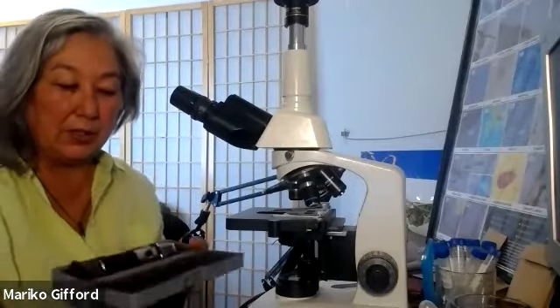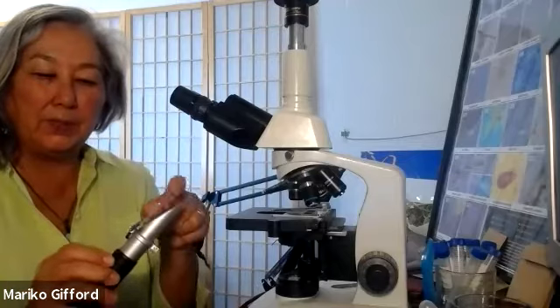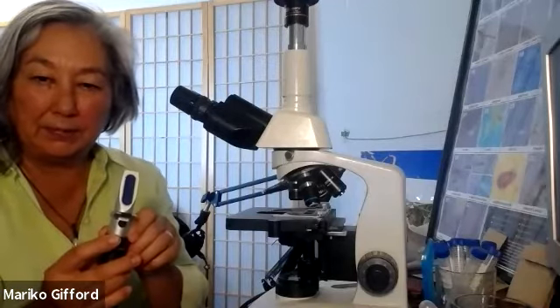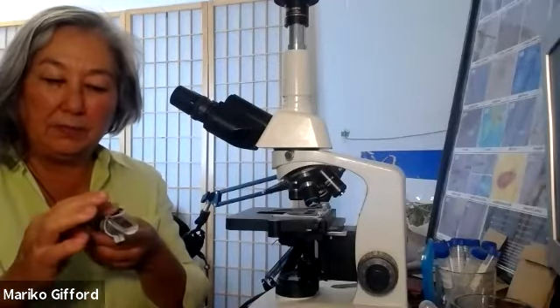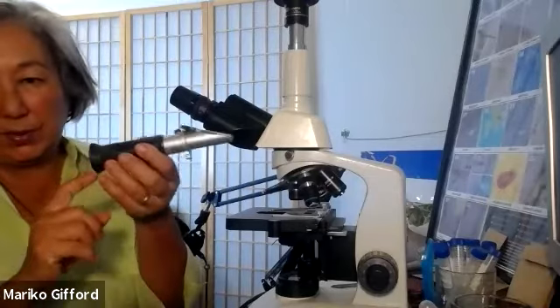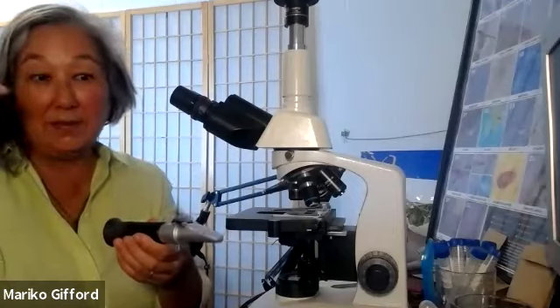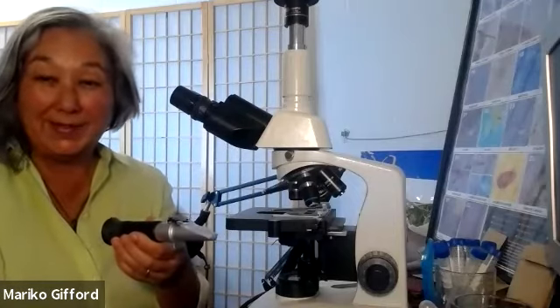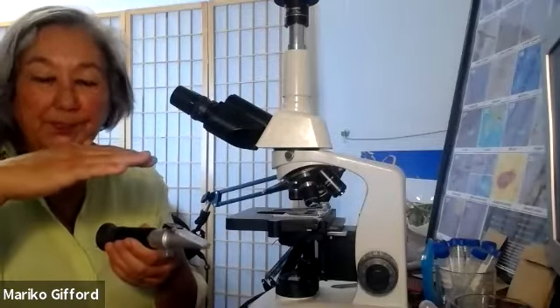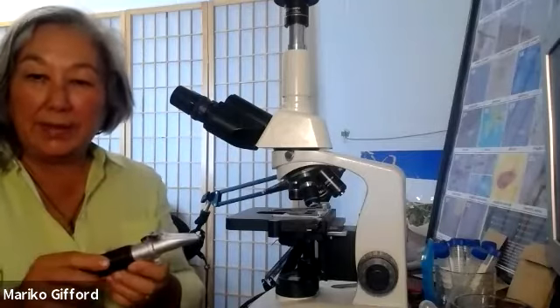Also, I always have the lens cleaner, and what you're doing is putting that little drop right onto here. So it's a little platform, and then this lays right on top of there, gets all the air bubbles out. And then you look through that scope, and it kind of looks like a ruler, but it's giving you levels. And it shows in a blue line, or the bottom part will be blue, because this is blue. And then it shows the levels, it's measuring that.